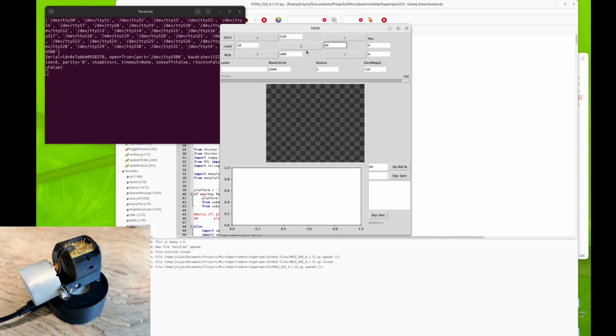The stepper motor that we're using typically has about 2048 steps for a full revolution. It does vary a tiny bit depending on the gearing, so you could check that for yourself, but that's what I tested my system to have.